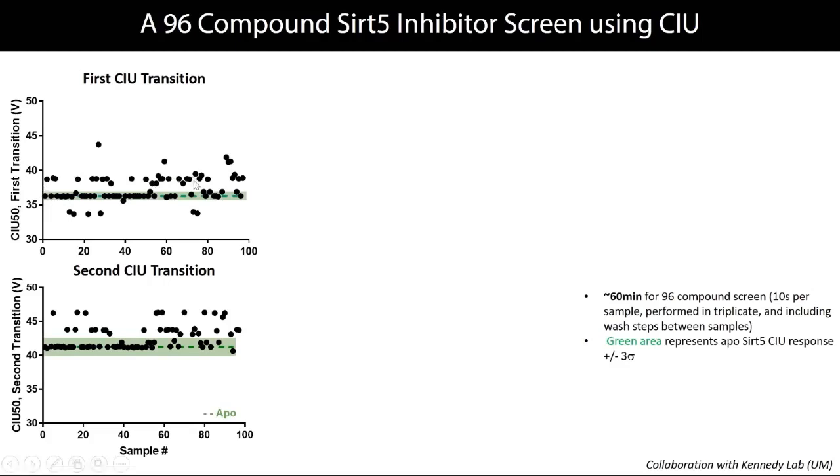Beyond that would be what we would call either a quantitative transition that leads to a stability increase for most of these compounds up here. And for down here, we're seeing a couple compounds that actually destabilize the protein. The second transition here looks like most of these compounds end up stabilizing the protein for the second structural transition.